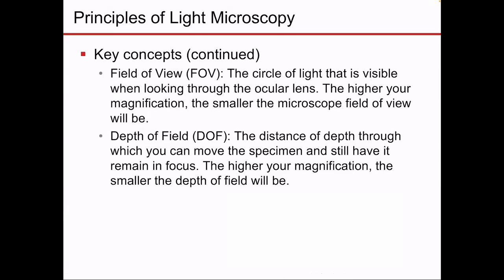We continue here with another two important concepts in microscopy, the field of view and the depth of field. In both cases, every time you increase the magnification, moving from one objective to another with a higher magnification power, both the field of view and the depth of field will decrease.